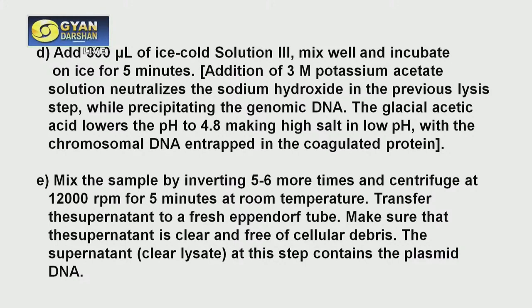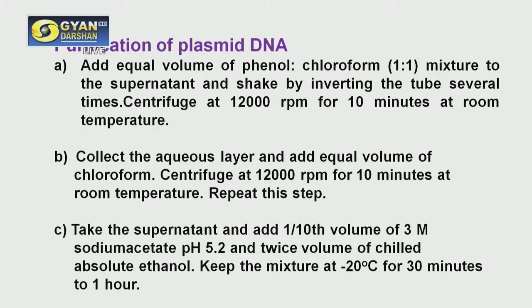It should be clear supernatant. There should be no cell debris and not any impurities. Otherwise, your plasmid preparation will be impure. So it should be clear, free from cell debris, and you collect the clear lysate in a separate Eppendorf tube. So up to this is done.